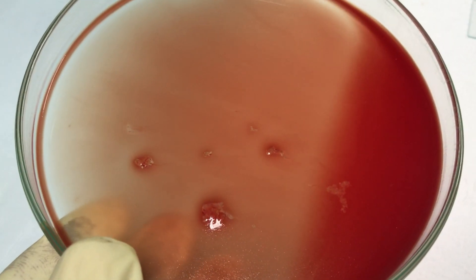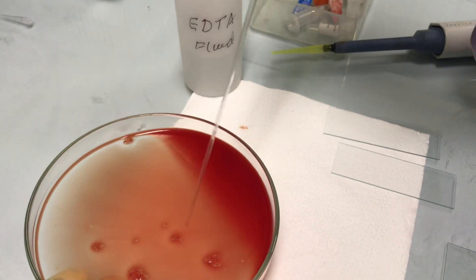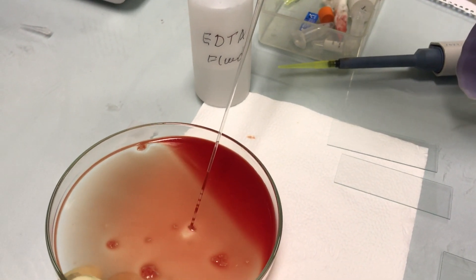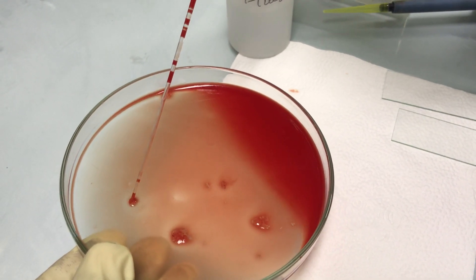We can collect the marrow particles by using a Pasteur pipette. The sandy granular structures are collected and placed over a glass slide.